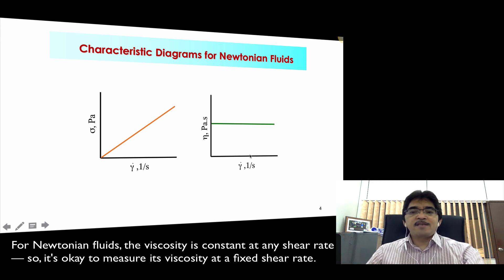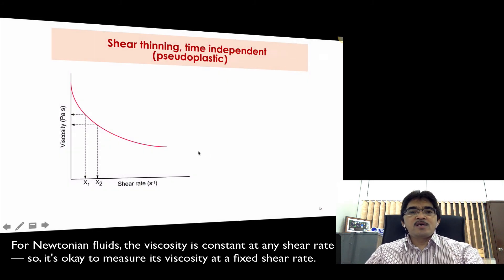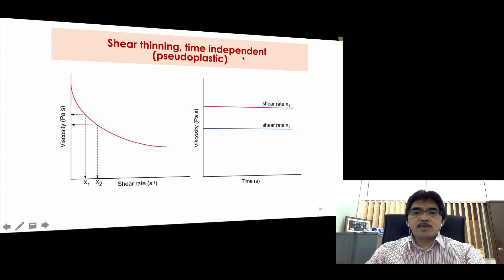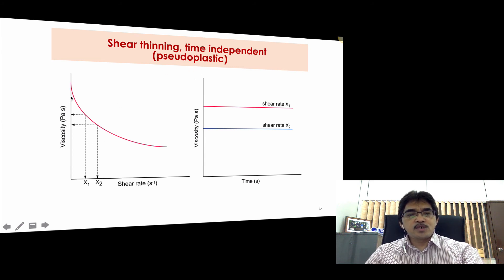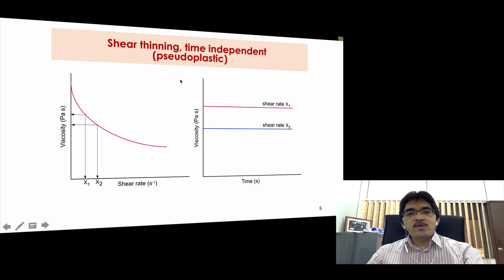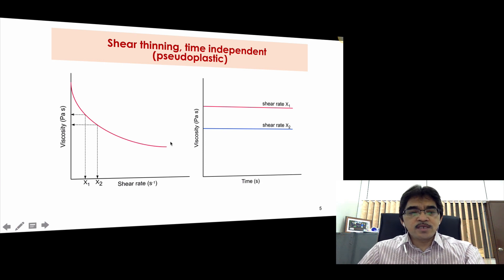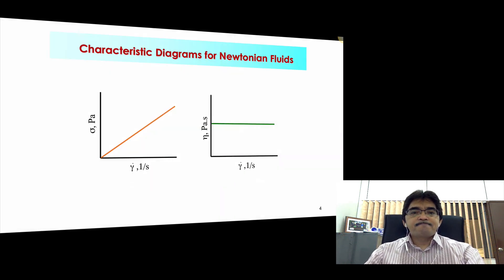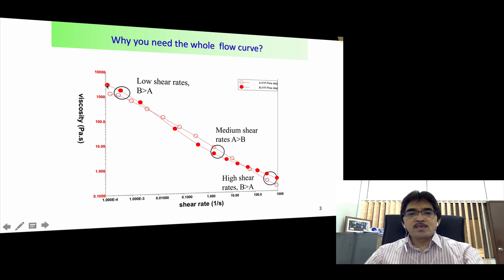Of course, if we change the temperature, then the viscosity will also change. But for a non-Newtonian fluid, for example pseudoplastics or shear thinning fluids, it's a good idea not to measure the viscosity at one shear rate but to get the whole flow curve so that we can see how the viscosity changes as a function of shear rate. For a non-Newtonian fluid, it's not a good idea to measure at one shear rate — it's better to get the whole flow curve. For a Newtonian fluid, we can measure at one shear rate, but for a non-Newtonian, it's better to measure the whole flow curve.